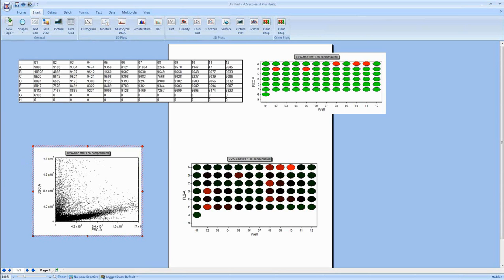And one question that we had was, can you set a threshold, not as a specific number, but a specific well? For example, maybe the threshold value should be the value that's in well A1. The quick answer to that is yes. Through the use of tokens in FCS Express, you can set a threshold based on a token. So you can set a threshold based on any of these live updating dynamic values that are here, whether here or anywhere else in the software.